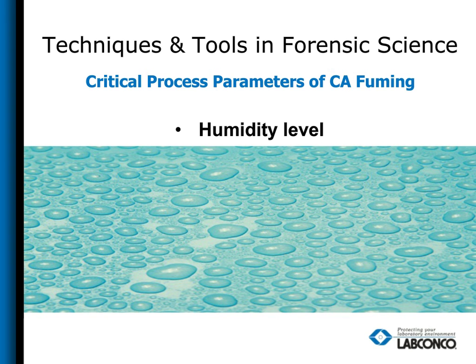A few of the things to keep in mind is the age of evidence. If it's been sitting in a very dry, non-humid area for a long period of time, pre-humidifying that evidence might actually increase your success rates on the development of additional latent prints. A lot of the processes out there in the field right now do not have this option, or it's an option you have to always include with fuming.